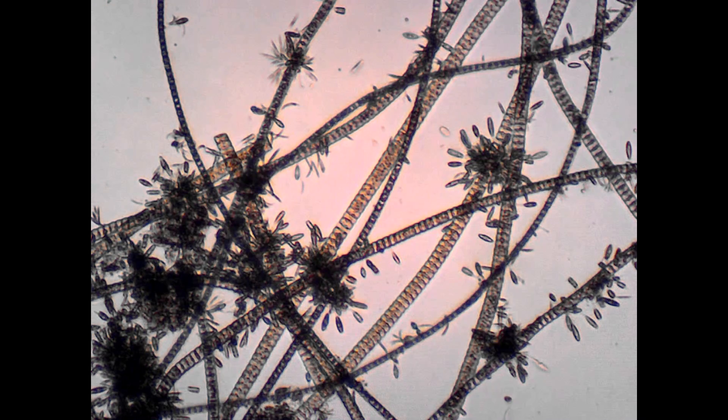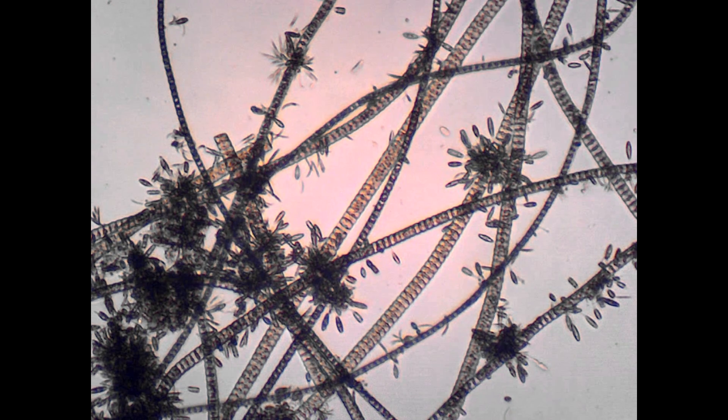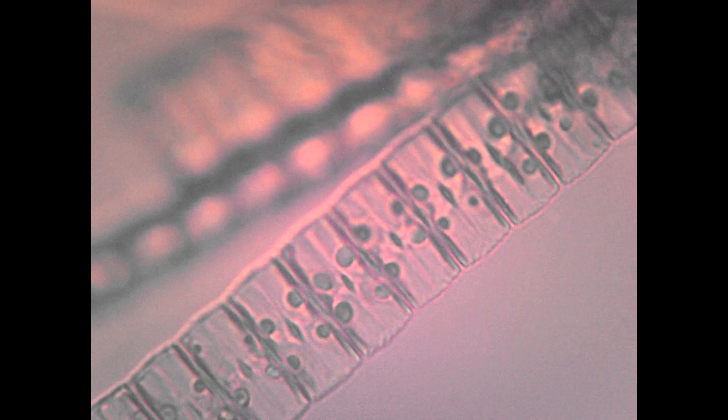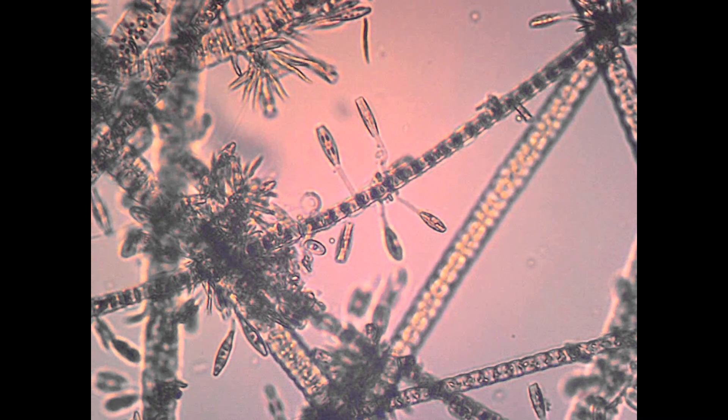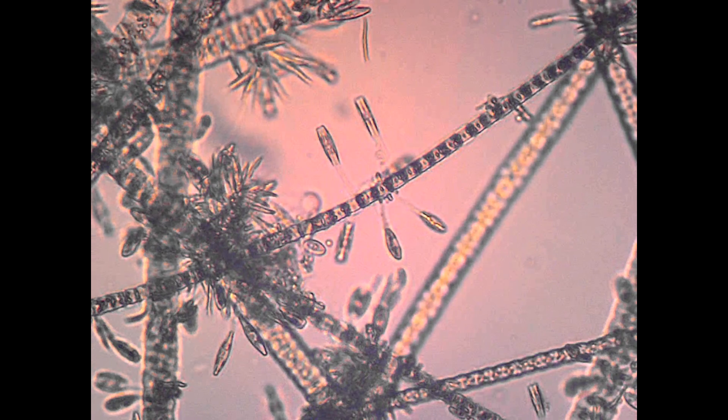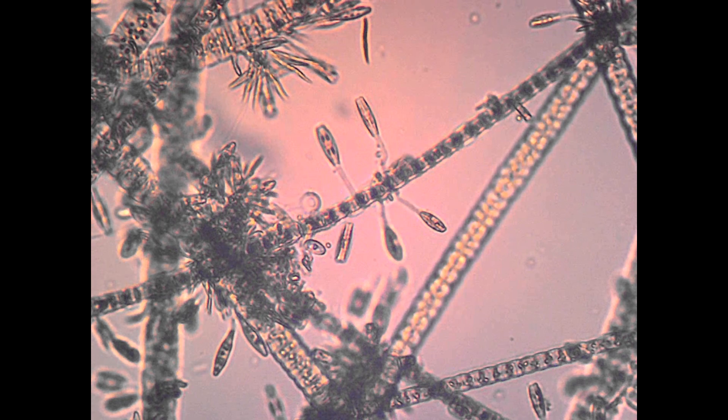This organism is segmented like the previous one, but its cells are much smaller. Looking closer at this organism, we can clearly see what appear to be nuclei. We also notice that there are other eukaryotic organisms which seem to be adhered to the algae, using it as a type of anchor as they filter feed off the water passing by them.